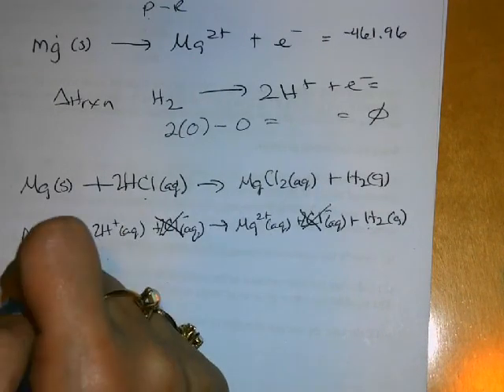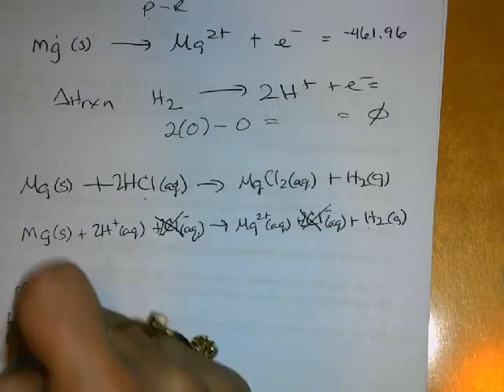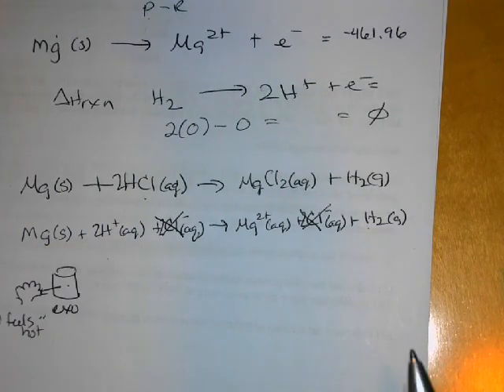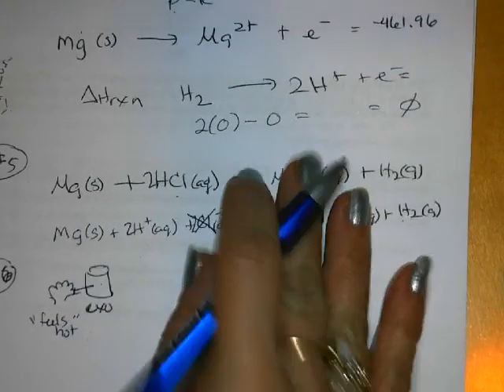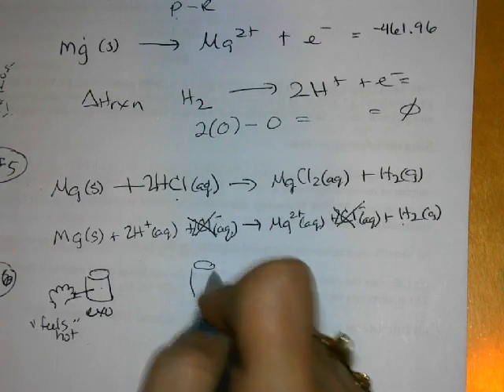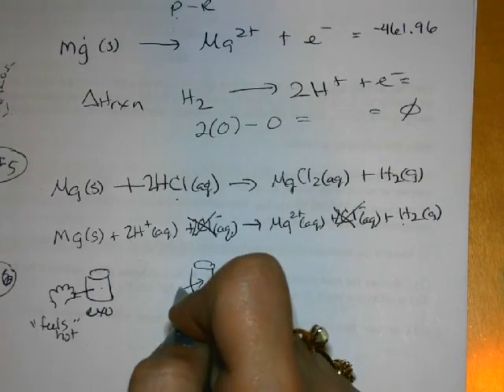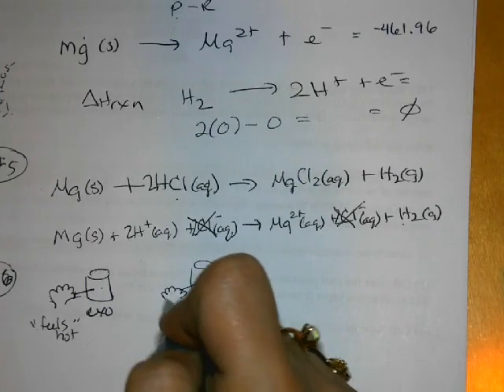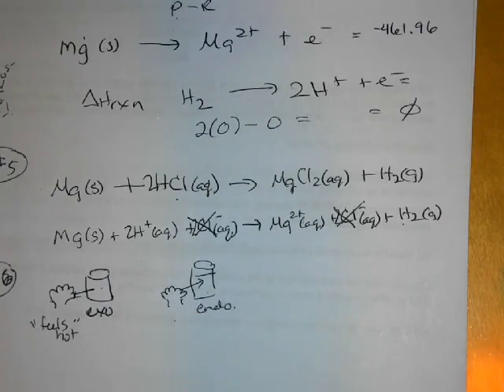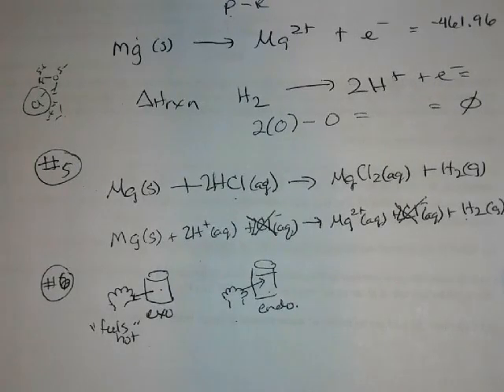So if it feels hot, remember, there is no cold energy, it's just the perception of heat leaving the hand. So if it feels cold, that literally means your receptors have energy leaving your hand and entering the system, and this would be endo. And you can write if it feels hot or cold. And what do you predict? You guys can predict that. That's not a big deal.